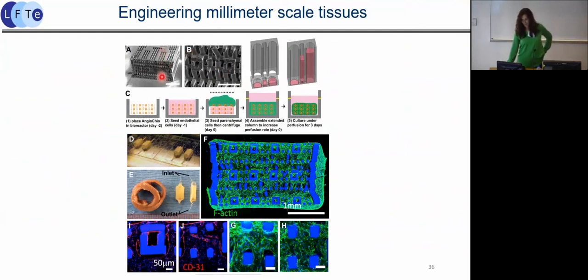One way to do this is you can take many small tissues that each have their own inlet and outlet and sandwich them into a larger structure. This is a modular approach that we showed that is unlimited. You can just go many, many times, but you don't have a single inlet and single outlet into this tissue.